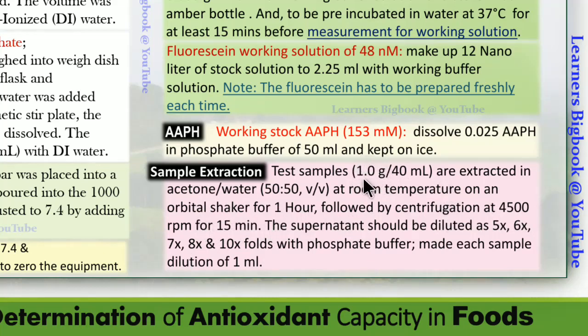There are many samples, and related to that there are many ways of extraction of the sample. There are samples which are used like blood, urine, fruits, or the food which you are consuming.